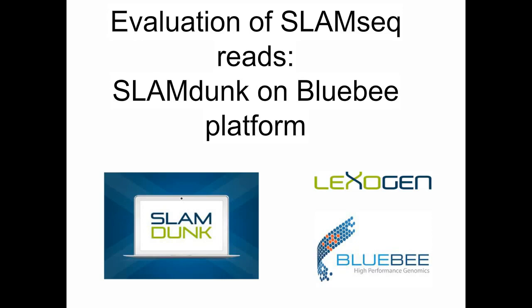Thank you. Stefan, this next one is for you. Could the conversion chemistry S4U alkylation be used with an RNA library prep method that does allow discrimination between mRNA isoforms and non-poly-A RNA? So in principle, yes, this is possible. SLAMseq is compatible with any RNA library prep method that involves conversion into cDNA. So yes, it should in principle be possible.